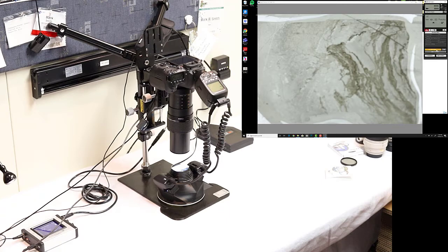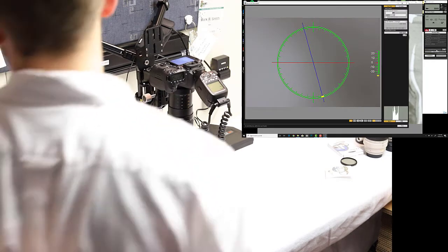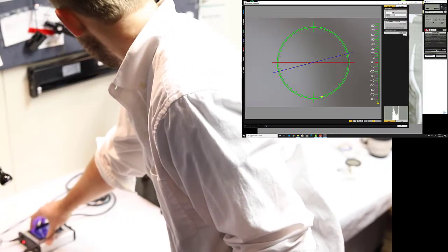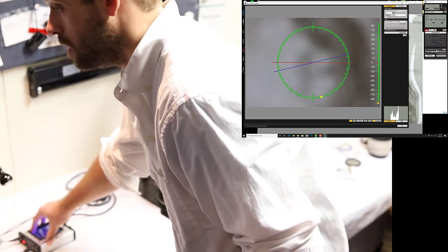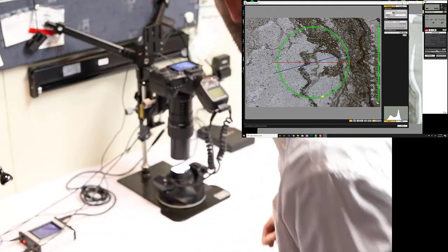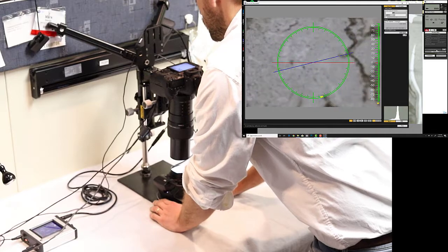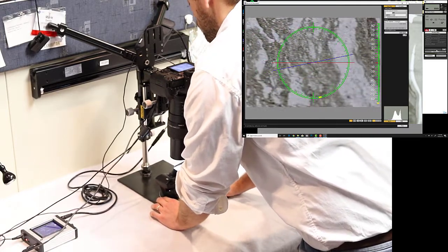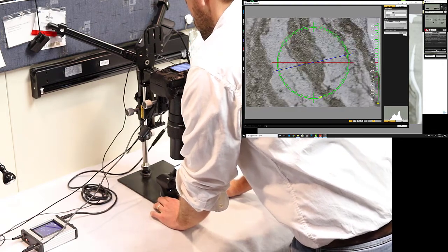So we'll open up a live view shoot and we'll start to play with our lens and our optics here to see where we are. So we'll bring the camera a little closer to our thin section. There we go. So now we're within the field of view. We can move our analyzer around to change what we see, or you can move the slide around on the surface, but it's much more precise to actually just move the analyzer around. That magnet is really quite nice.